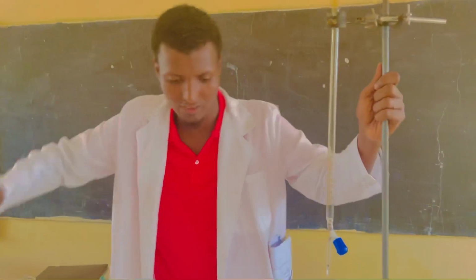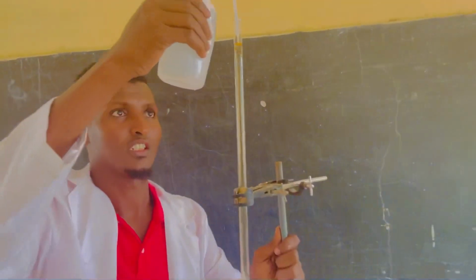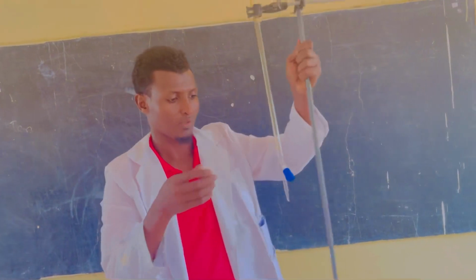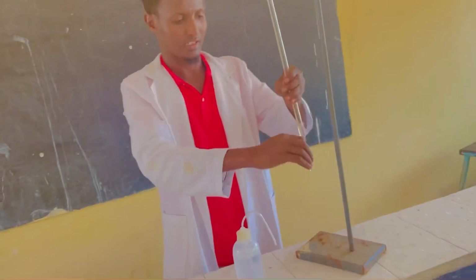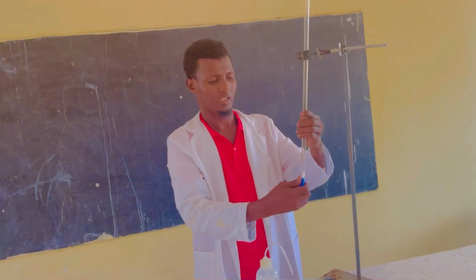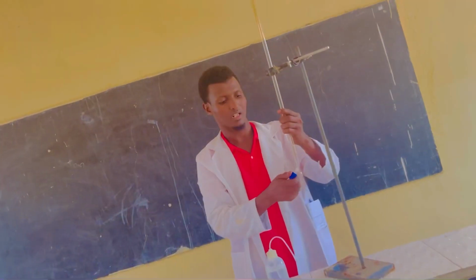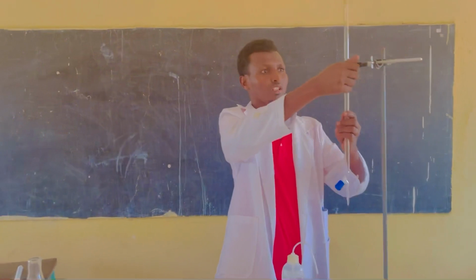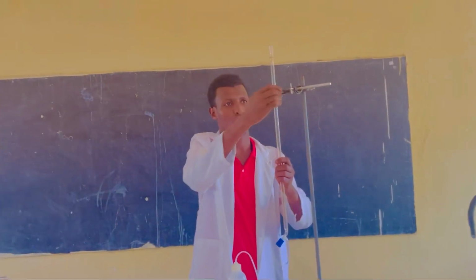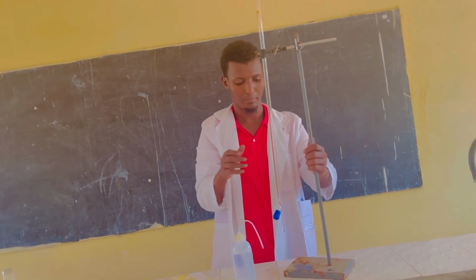So first of all, I will check whether the burette is working. So it means my burette is working. So I'm going to rinse the burette because it can contaminate and give a fake result, isn't it? And I'm now filling my burette with solution S. Good. So this is my burette.